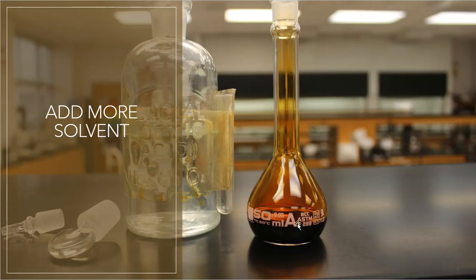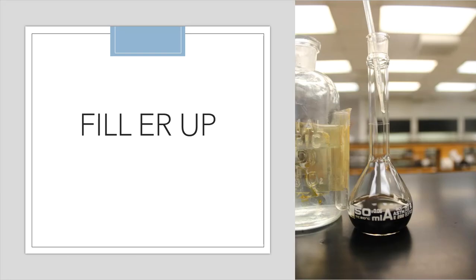Here it is. You can see all of this orange vapor that is now escaping my volumetric flask. There's nothing really I can do about this. Unless I had a cold volumetric, that could have prevented some of this from happening. But I know that as soon as I add acetic acid to it and try to fill it up to that line, look at what happens.